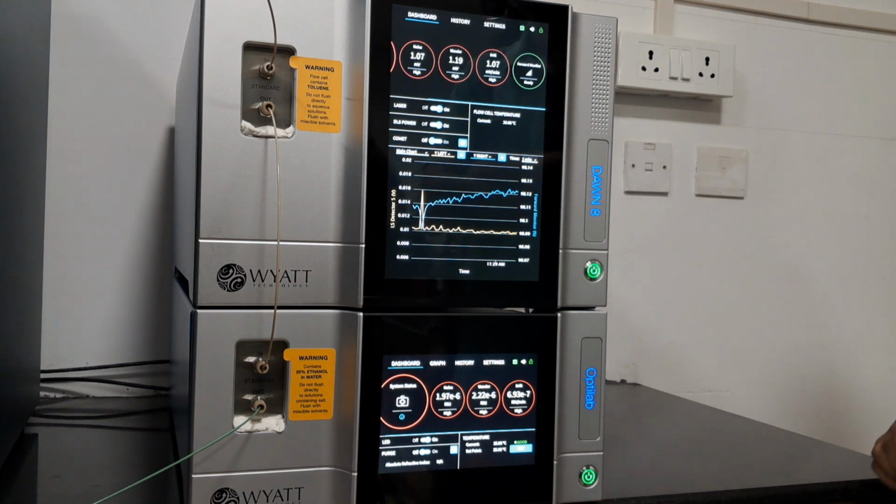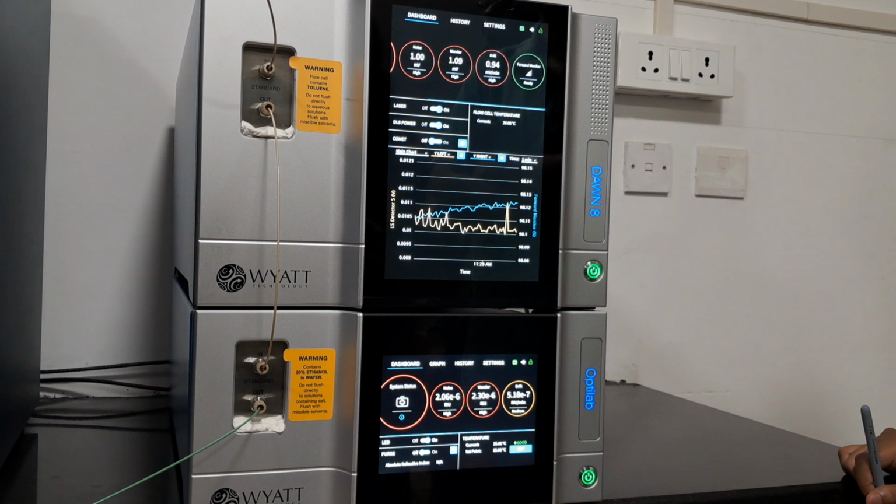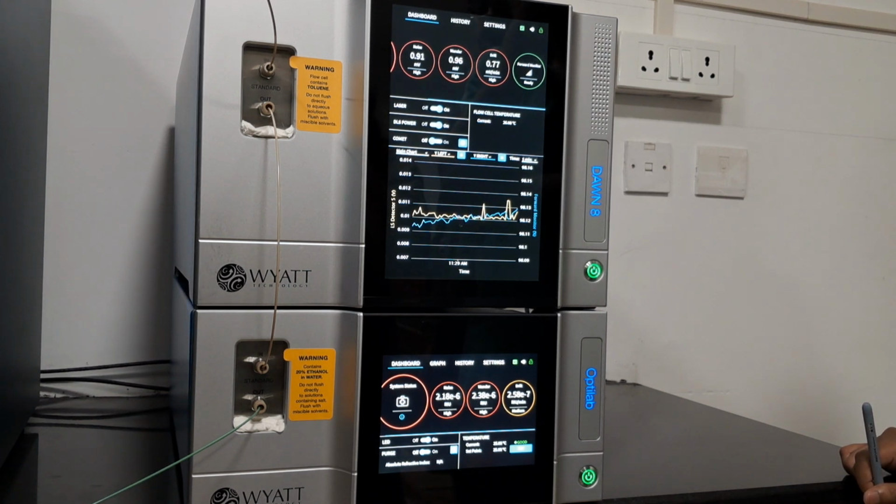Ideally, you give 0.5, and it should be stabilized for 3 to 4 hours minimum. Actually, I'll say 4 hours. The application specialist, Leo, will give you a broad answer only. You also have to find a good literature that can give you the probable values or the probable range. But for this you have to dig in.